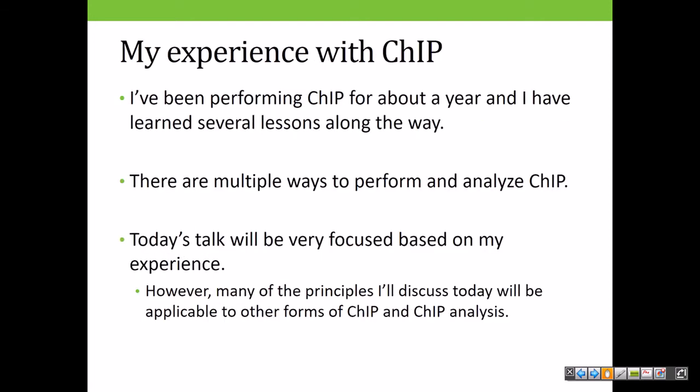So my experience with CHIP has been very limited based on my own, I guess, research questions. I've been performing CHIP, ChIP-qPCR, for about a year, and there are multiple ways to perform CHIP. I don't want to give you the impression that I'm going to be able to cover all of them. I will not. Most of this talk will be focused mainly on my own experience. However, having read enough about the other forms of CHIP, I can definitely say that there are certainly principles of application and analysis that will be translatable to other forms of CHIP. So hopefully you will glean something from this if you're doing other forms of CHIP.